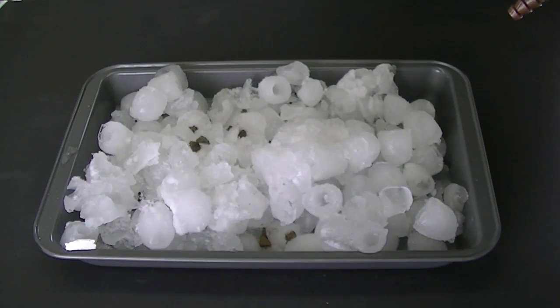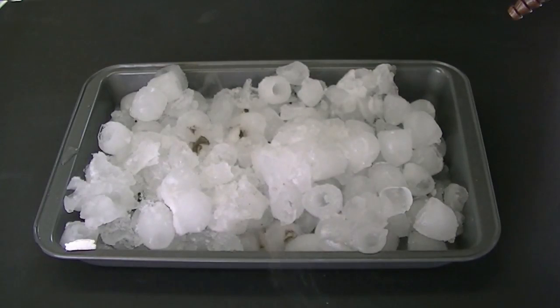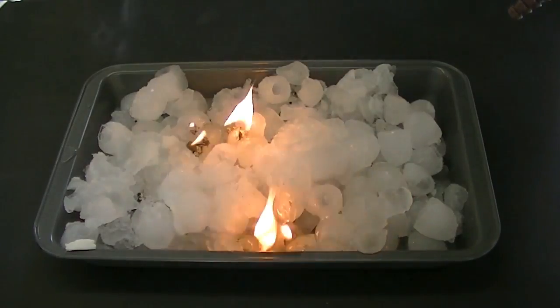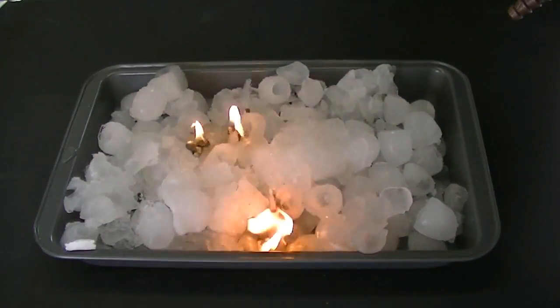That fizzing is the reaction that's happening between the melted ice, which is water, and the calcium carbide to form acetylene gas. So as the ice melts, the water that's formed reacts with the calcium carbide to form acetylene gas, which we should be able to light on fire. It looks like fire and ice!